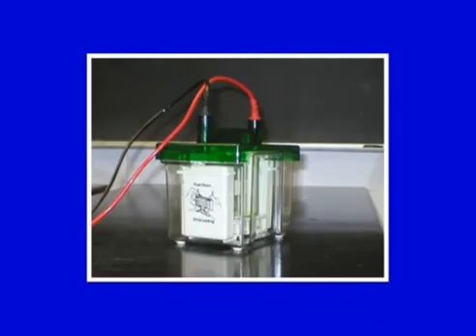Likewise, tube gels could be run in here, where rather than a slab gel or plate gel, you will have a tube and only a single sample could be run. The whole apparatus looks something like this. You have an enclosed buffer chamber, and these are the two electrodes here.